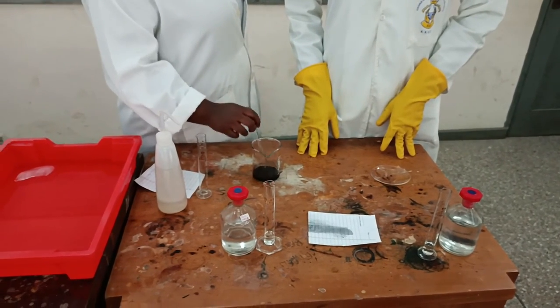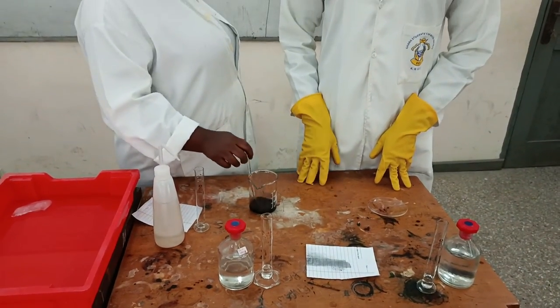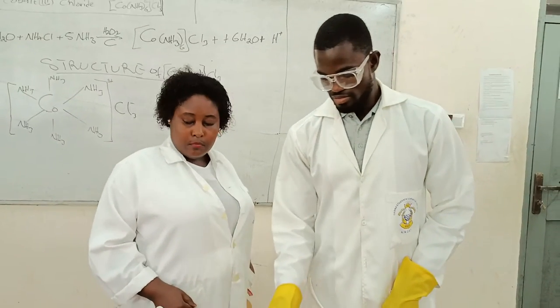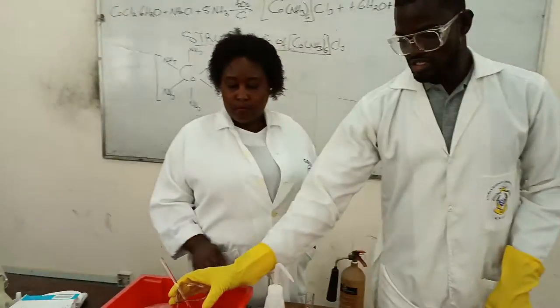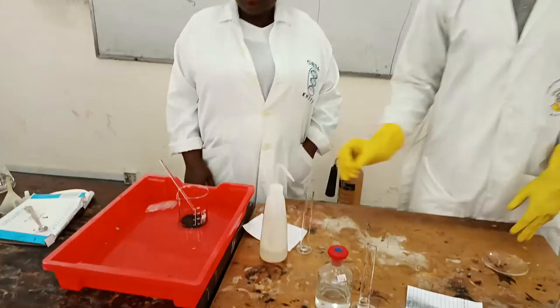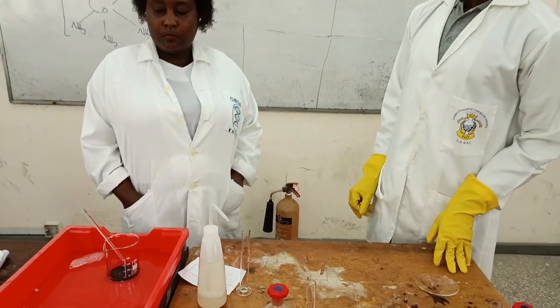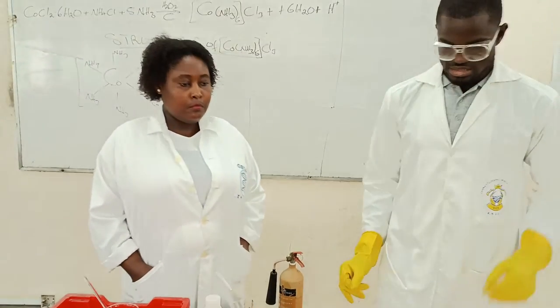Now the next thing is that we'll be taking our mixture to the ice water bath. This is our cold ice water bath. Alright, now we are going to add our ligand, and here is the ammonia.